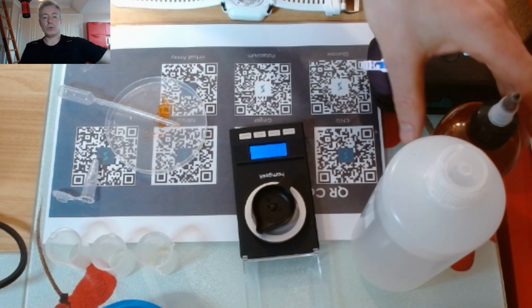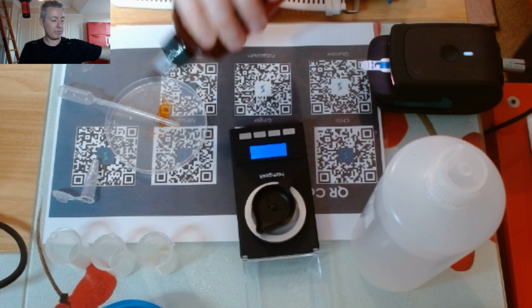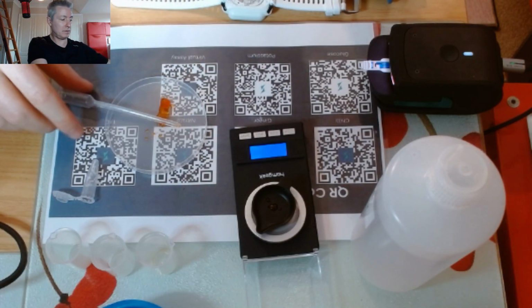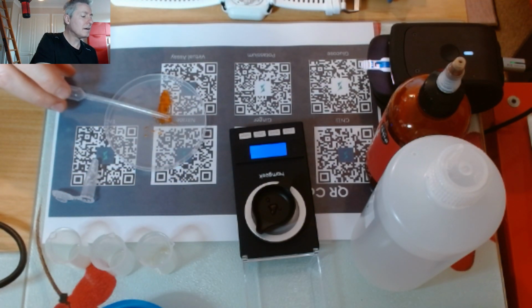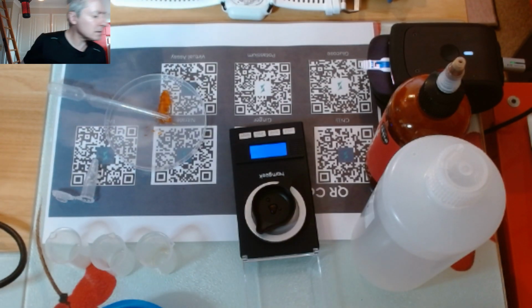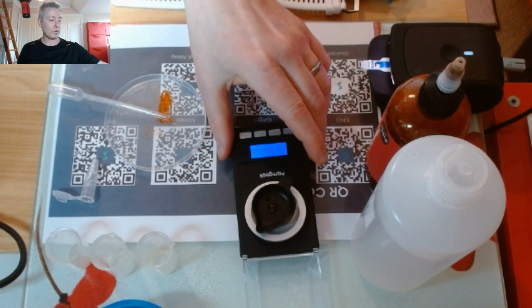I just need a little bit more. I want 0.1 and I'm at about 0.082, so I just need a bit more. Right, so I'm just going to have a quick lean in and see what that actually says. All right, so it's 0.106. So I'll take that. It will give me something like a 6% error, but I just want to show the workflow fairly quickly.